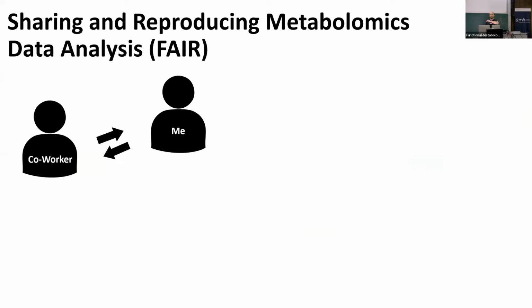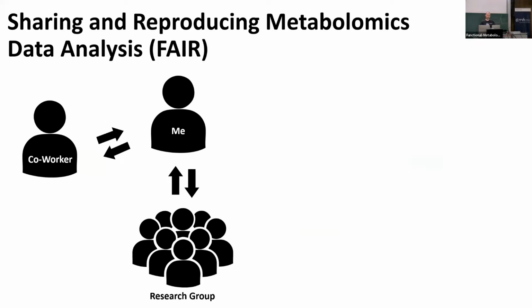But if Allegra puts them in the repository and I have access, it's really simple to create analysis from it, to collaboratively visualize this in the dashboard. We can do this right in the web browser. And on Friday, we're going to show you a little more how to do that. Anyway, it facilitates reproducing and collaboratively doing data analysis.